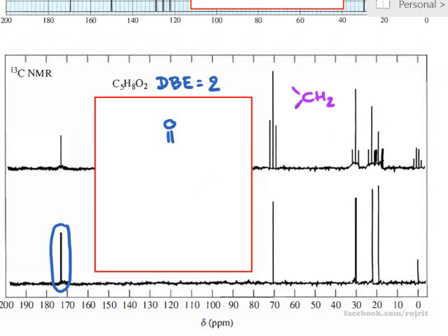If you have only CH2 and no CH3, you may be quite sure that this is a ring. Because if it is an open chain, you have the very end of the line, which is CH3, but you have no CH3. So from this, you may be sure that it is cyclic for sure.